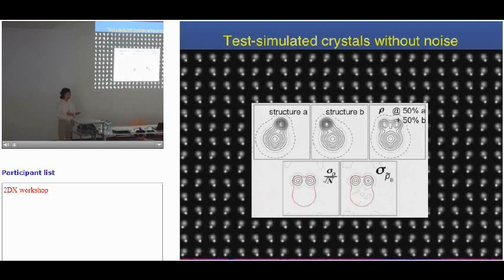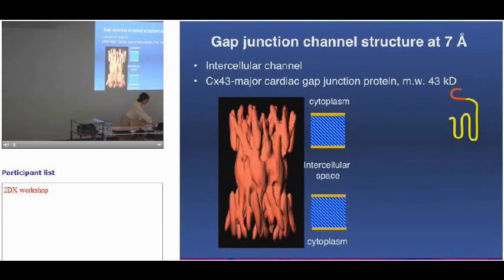So each one of the images is different. So I have a number of them. I think I had 64 of these images. And then I can start doing bootstrap resampling to see if I can get the same estimation of the variance back, because I knew what my variance is. So the result was pretty satisfactory. This method does work for 2D crystals. With the process that we went through, we've been able to retain the shape of this variance map.